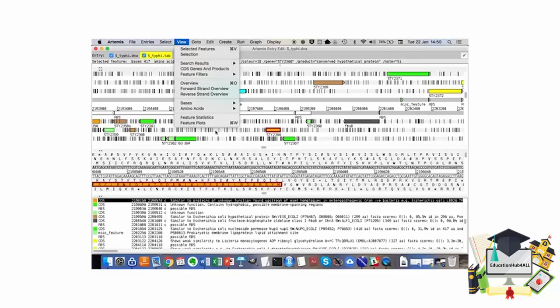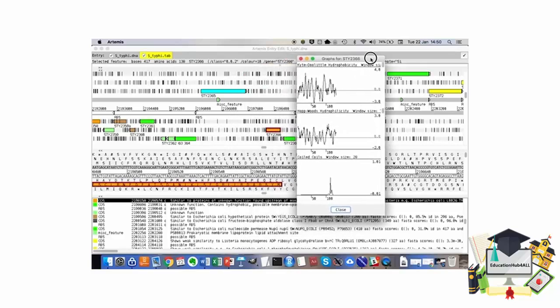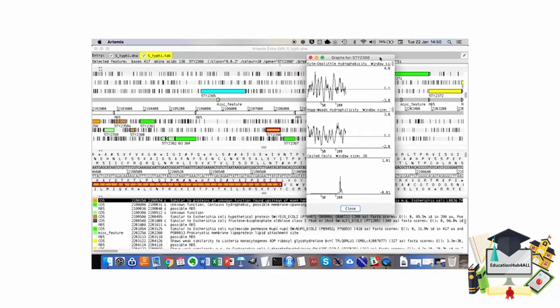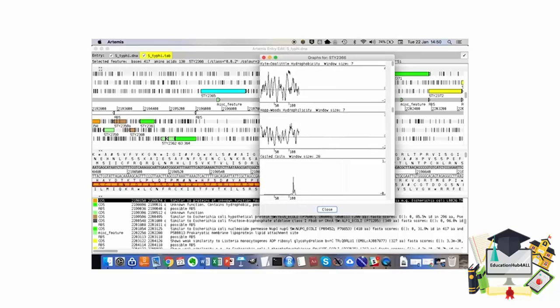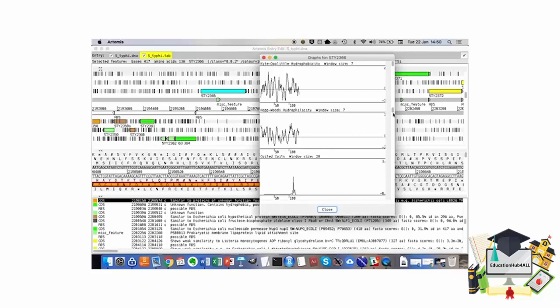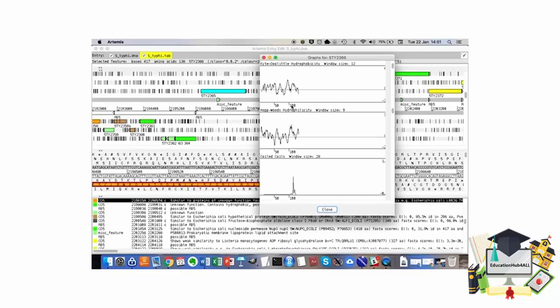This opens a window in which we can see the hydrophobicity of the protein encoded in that particular gene, the hydrophilicity of the protein, and the coil-coil regions or the probability of encountering a coil-coil region. This slider on the side works the same as for the GC content we've seen before. We can smoothen the plot or make it sharper. Notice that the hydrophobicity is right opposite to the hydrophilicity—they look like mirrors, because where a protein is very hydrophobic, it's going to be not hydrophilic.